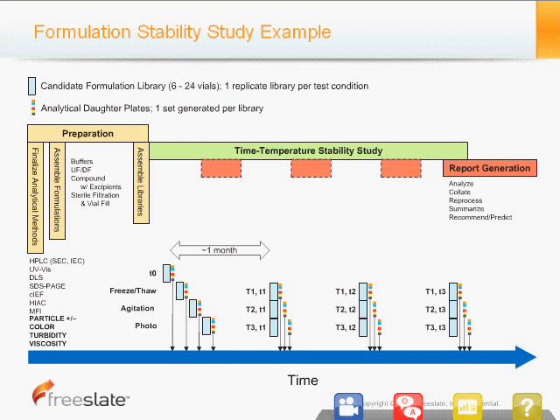You may need to reprocess some of this data, particularly HPLC. The HPLC method you may have developed for an unstressed sample may not necessarily apply to a stressed sample, say that you've had at 40C for 3 months. And so you may need to go back and adjust your analysis and processing methods in HPLC and reprocess the data so you've done all your experiments in a consistent manner. And then finally, you need to summarize all this data into a report and also potentially recommend some formulations to customers, and maybe also try to use this data to predict the stability of the compounds.